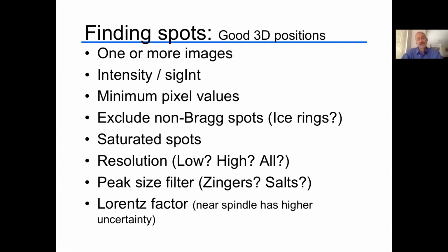If they're saturated, that means you don't know the true signal at the upper end, but you still know the position. Do you use low resolution, high resolution, all, and do you do a filter so that you can filter out cosmic rays or salt diffraction and so on?